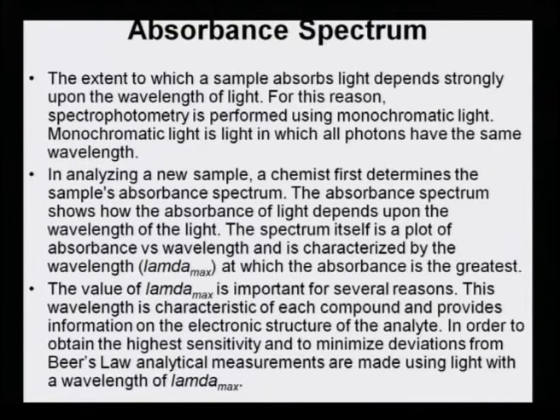In order to obtain the highest sensitivity and to minimize deviations from Beer-Lambert's law, analytical measurements are made using light with a wavelength of lambda max. So, this value is of great significance.